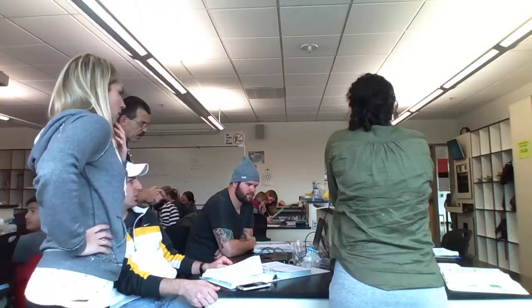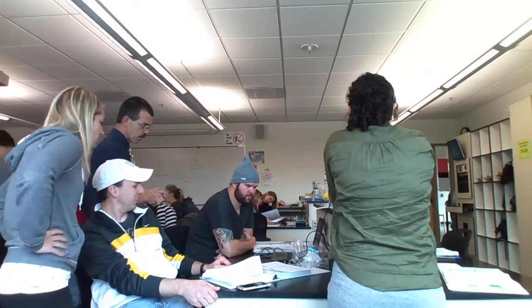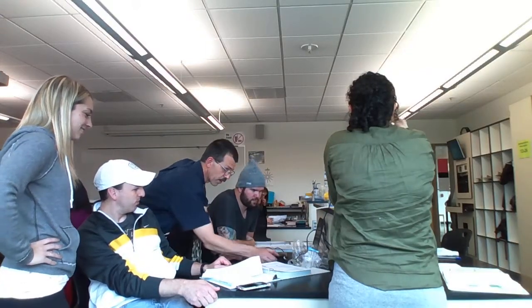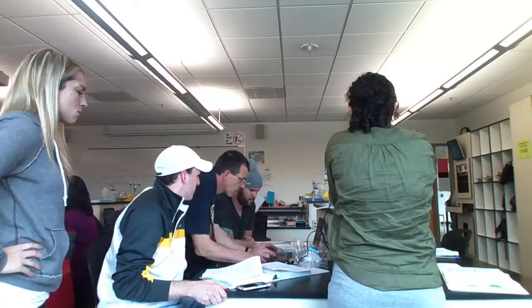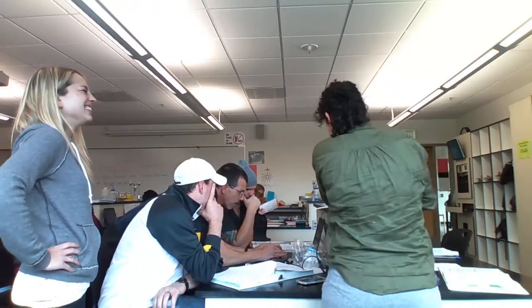Just do it like a normal flow. It's getting flow rate, but it's not picking up anything. Waiting for trigger. I was kind of hoping to get some good values. Hold on, let's see if I can set something up.